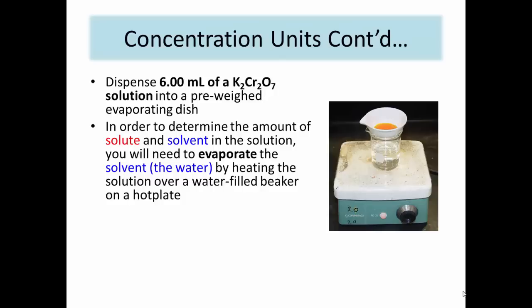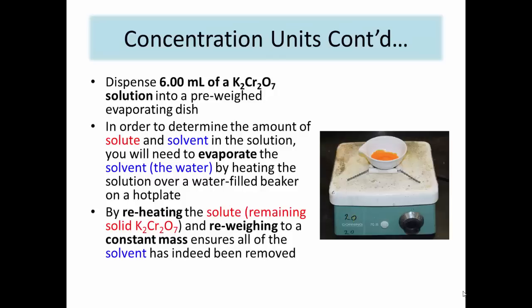Once evaporated, remove the dish and remove any water droplets from underneath it. Place it on a clay triangle on top of a hot plate, which should be at a temperature setting no higher than 2. Continue until a constant mass has been reached. This will ensure that all of the solvent has been removed.